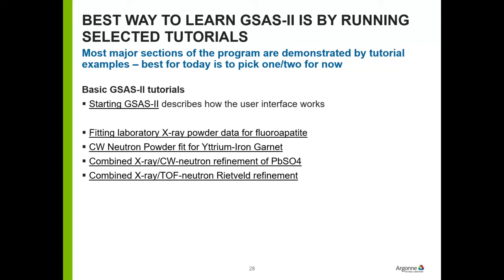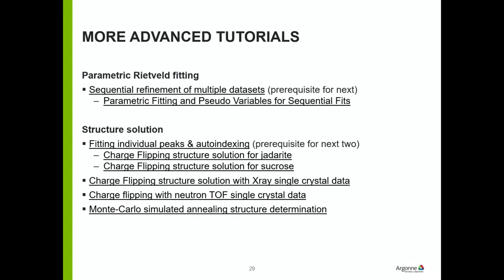And this one is what's used in the X-ray neutron summer school at Argonne and SNS. There's a combined fitting between X-ray data collected on 11BM and neutron data collected on PowGen. Other ones, there's a couple of ones for doing sequential fitting. These things are Rietveld refinements. They track parameters as a function of temperature, I think it is.